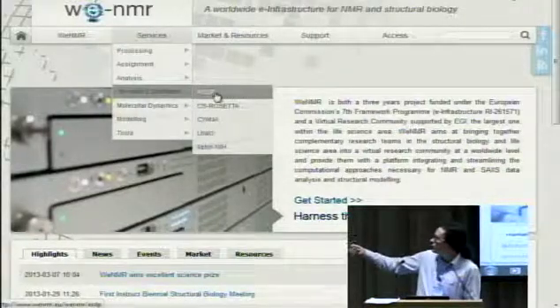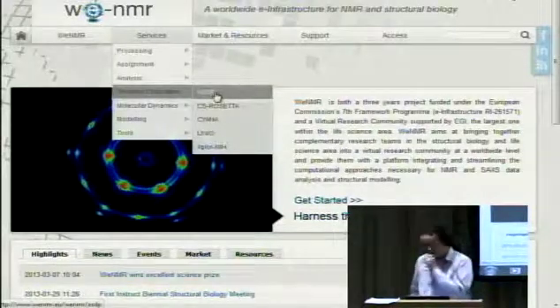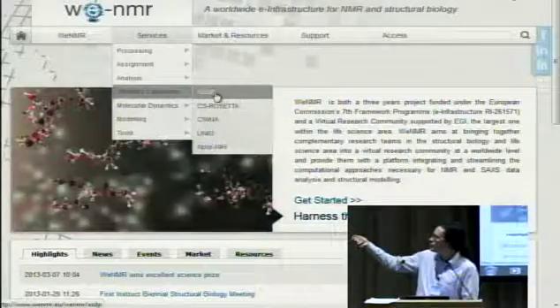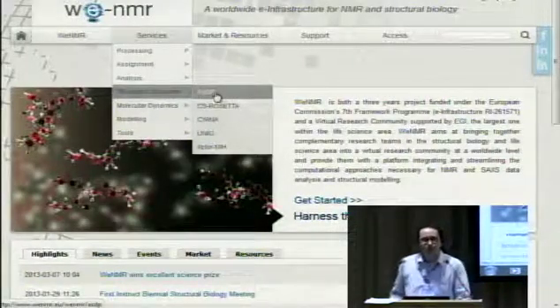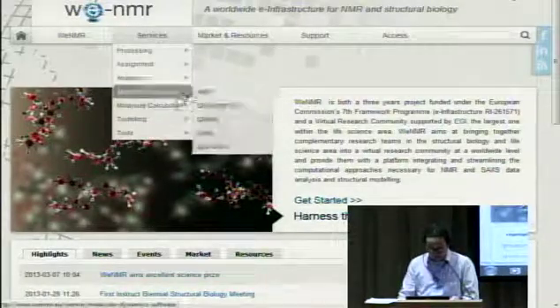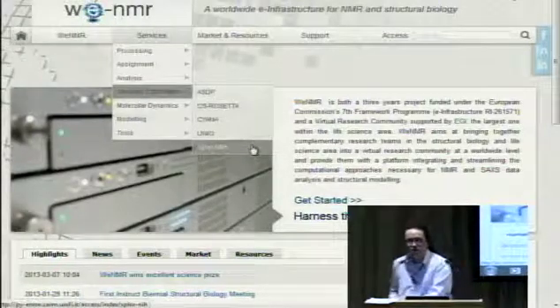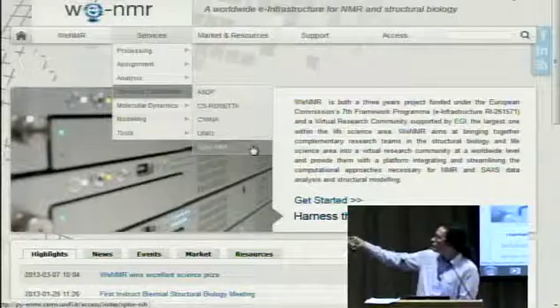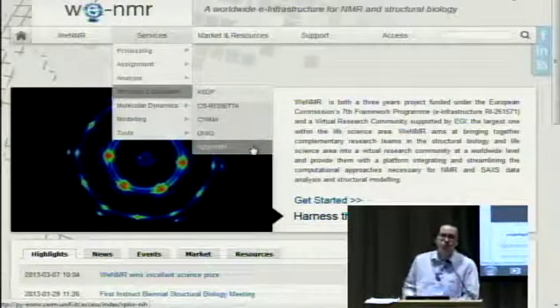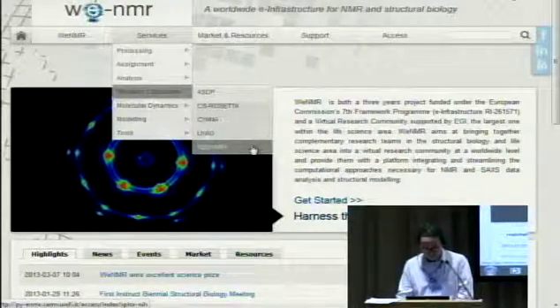These four were all in the WeNMR assessment. In principle, if one wants to try some automated calculations, we do provide the resources to do that. And Xplor-NIH instead is one of the traditional ones where you don't do the automated assignments. I have to say these programs like Cyana or Unio can be used both in automated mode or in manual mode, so to say.